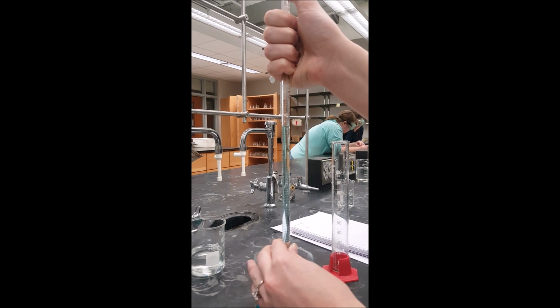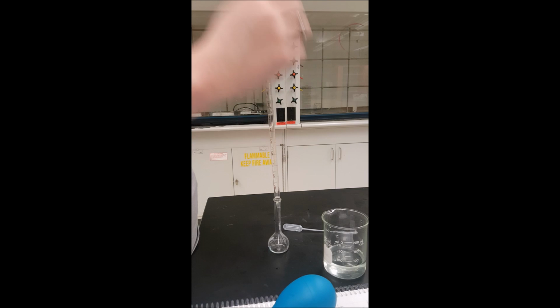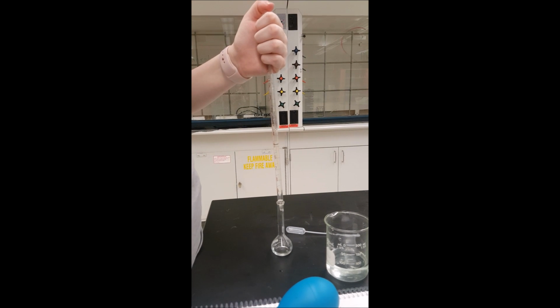After you've done that, you can transfer some of your stock solution to a volumetric flask. Whenever you do this, make sure that you record the initial amount of stock solution, put however much of it that you would like into the volumetric flask, and then record how much you have left in the pipette. You're going to subtract these two numbers to get the volume of your stock solution.